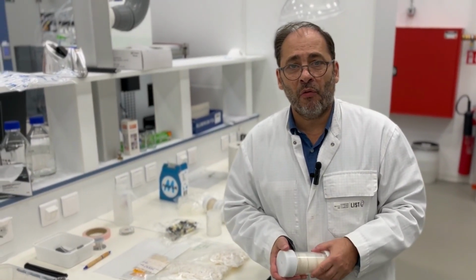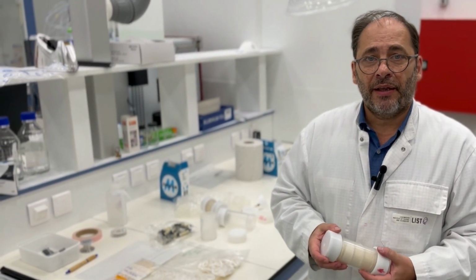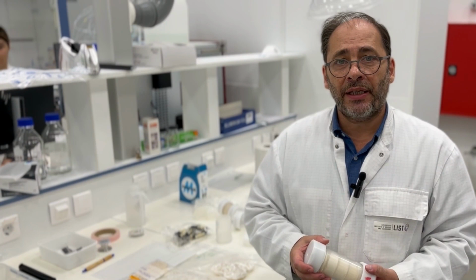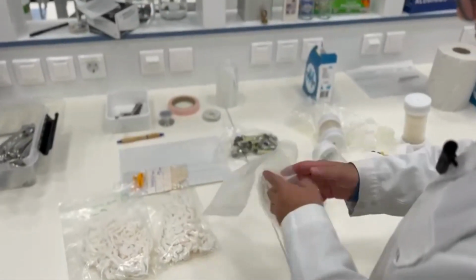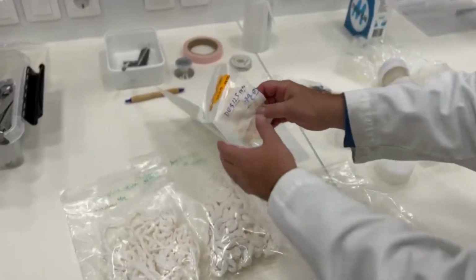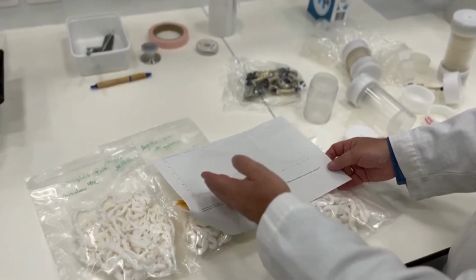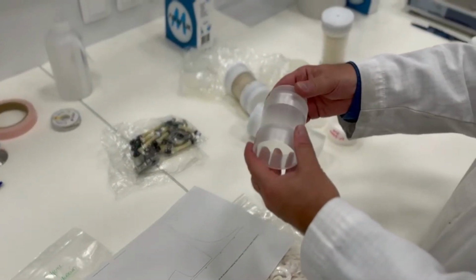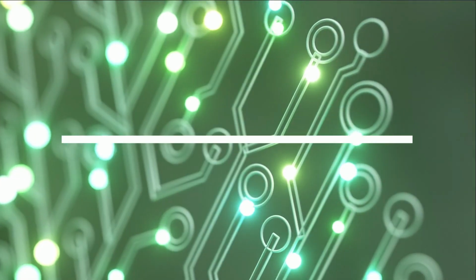Standard chromatography works on the basis of utilizing a packed bed of beads. This technology has been around for many years, several decades, but nowadays we see a shift into a different type of materials, for example, fiber-type adsorbents. These adsorbents present many advantages, like higher flow rates, higher productivities, and the ability to deal with a repertoire of products which goes beyond the traditional protein manufacturing that we have seen.